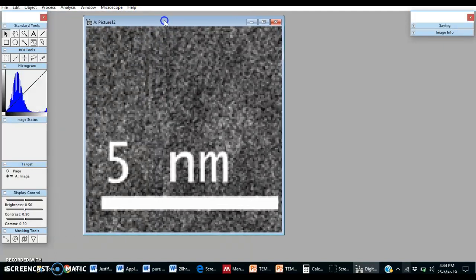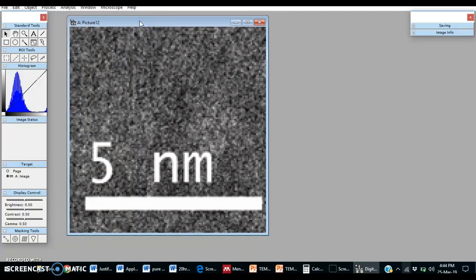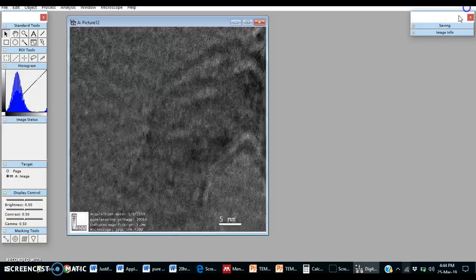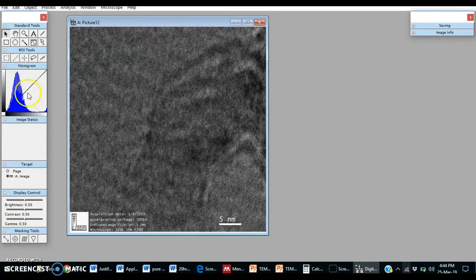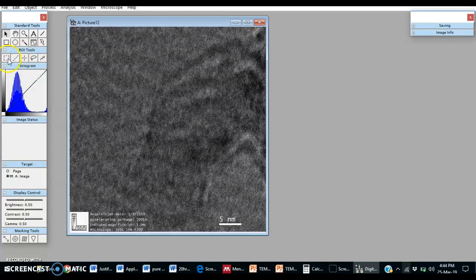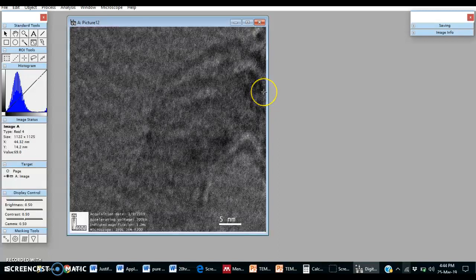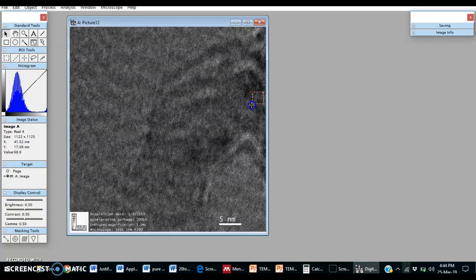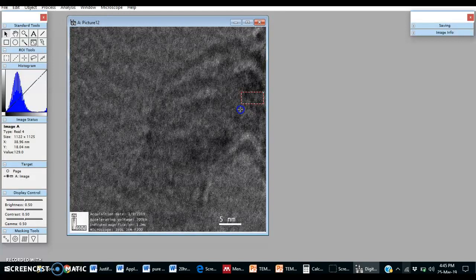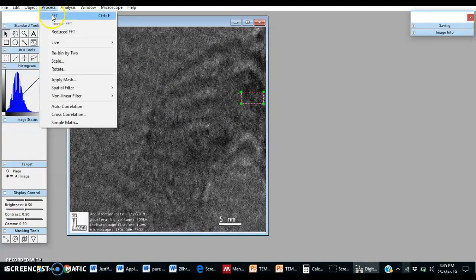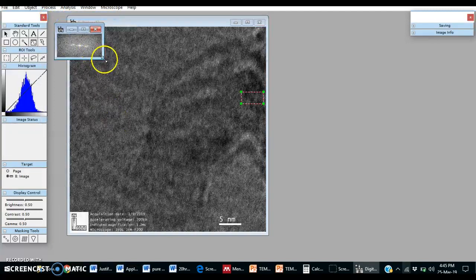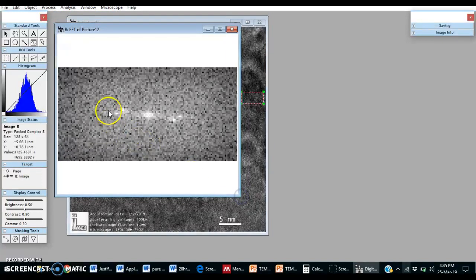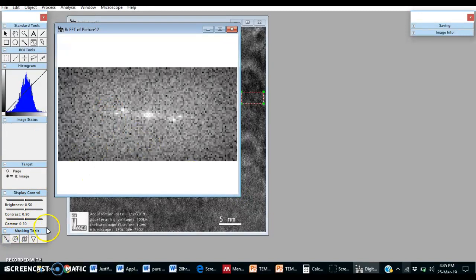Now select this ROI tools, this tool, and press Alt, then left click of mouse. It will select a particular size area, process effective. Now choose these masking tools.